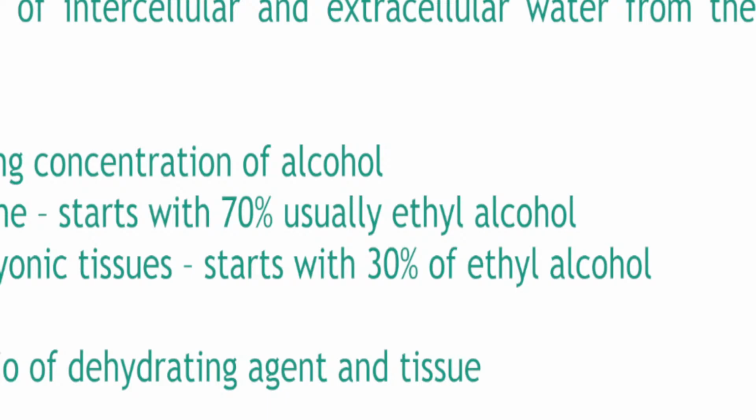Now, what is the ratio? What is the important thing that you need to remember? The ratio of dehydrating agent and tissue. The ratio should be 10 is to 1. Okay? 10 is to 1 volume of dehydrating agent versus the tissue.